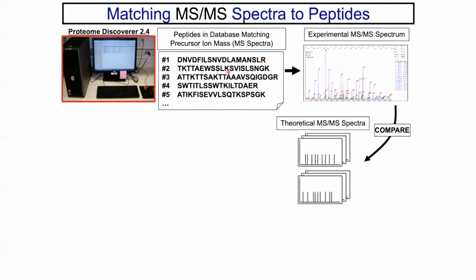However many you allow for this tolerance, you can get longer and longer peptides. That's one thing that can happen. But you can also have a different composition of peptides. You may have ones that are more basic in nature, because you may have internal basic residues if you have more miscleavages. And so that's something to consider.